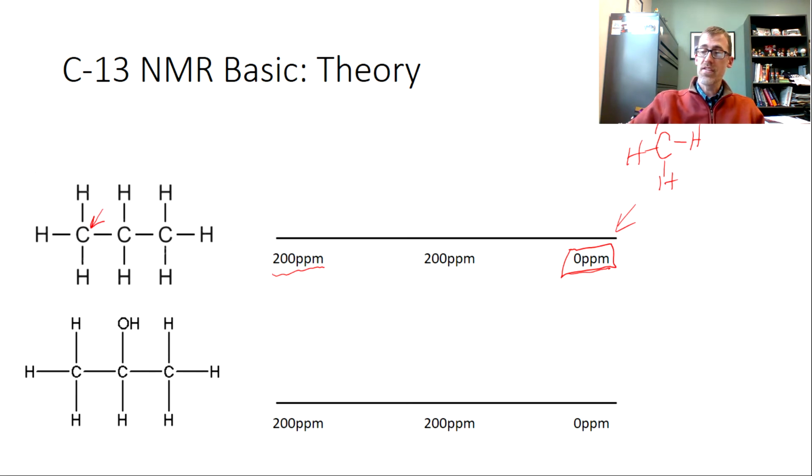And that ends up being downfield. So this end is high energy, this end of the field is low energy. And you could also associate this with normal.